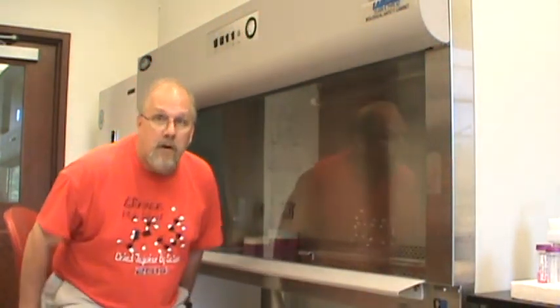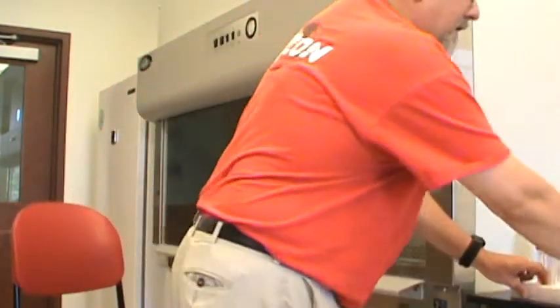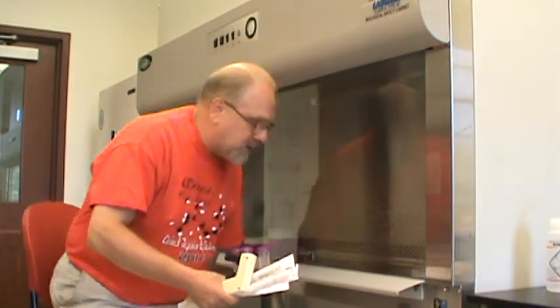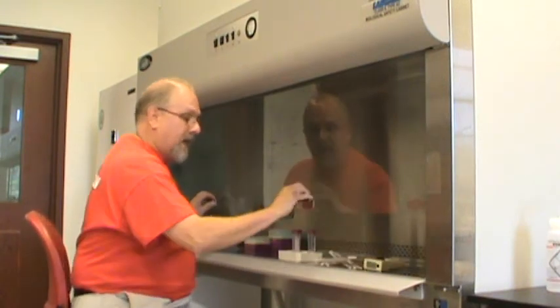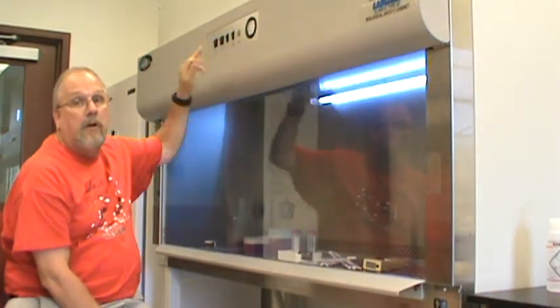When you are getting ready to work in the hood, one of the first things you need to do is make sure you have everything you need before you start. It's not something that you just come out of and run into the lab next door to get things. So we want to make sure we have everything we need in order to transfer our solutions. We pull up the sash, put the materials in the hood, and with this button right here you can turn on a UV light.